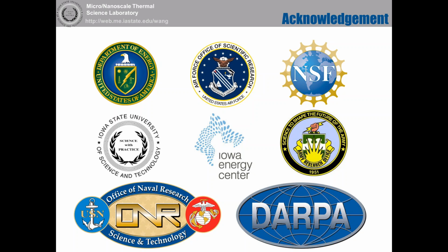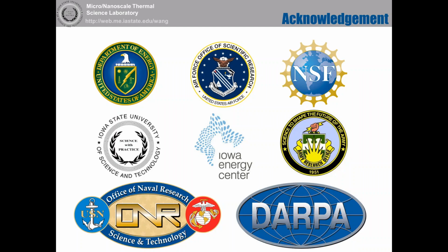Okay, so the question was, does this technique work for any other materials: cell membranes, polymers, anything else? Oh, yes, absolutely. One thing I didn't show, we are doing research on polymers like polyethylene, PMMA, and also PET, and other materials. It works really well. The signal is really strong. We have also used this technique on other samples, like organic ones, like human hair. It's really good.